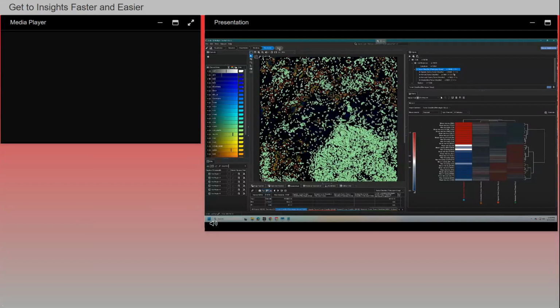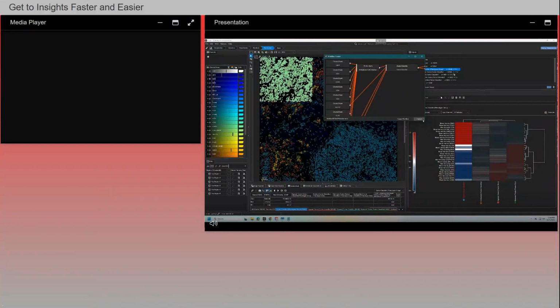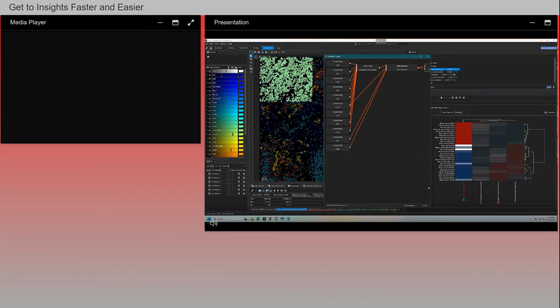Now that we've done this, I'm going to show you how you batch. In this example, you can batch different object detection as well as different spatial relations. If we select this option, every step involved, including detection, classification, and spatial relations, will all be batched at the same time. And here's a visualization of all the input channels and output for our batching process.